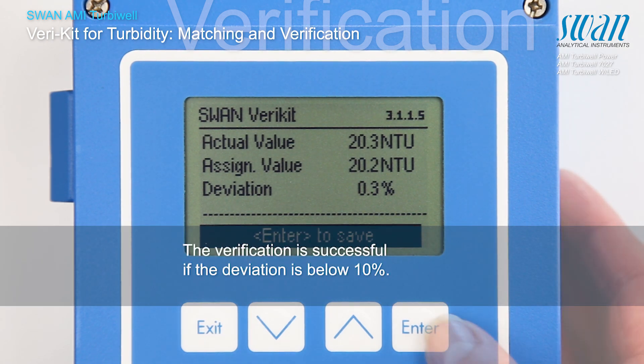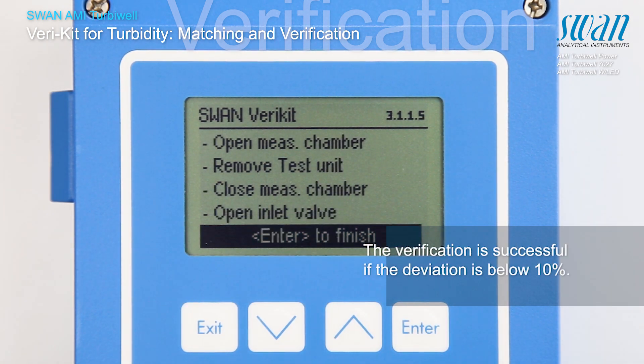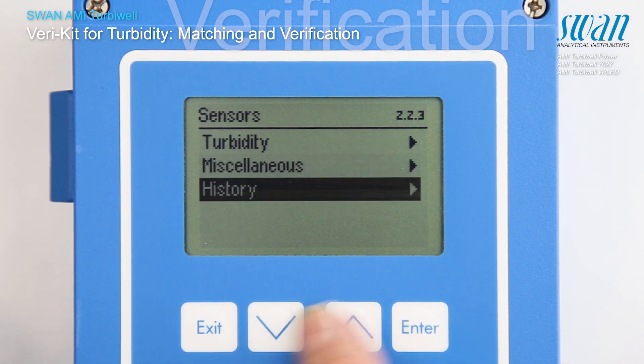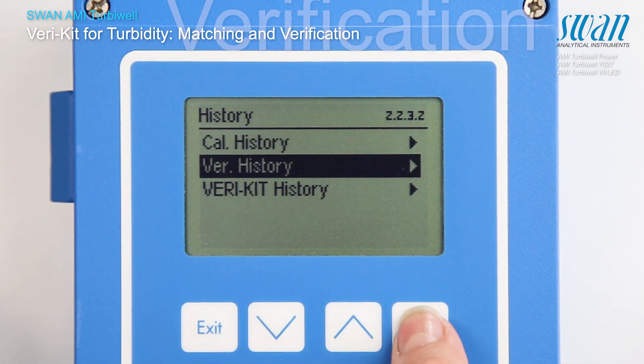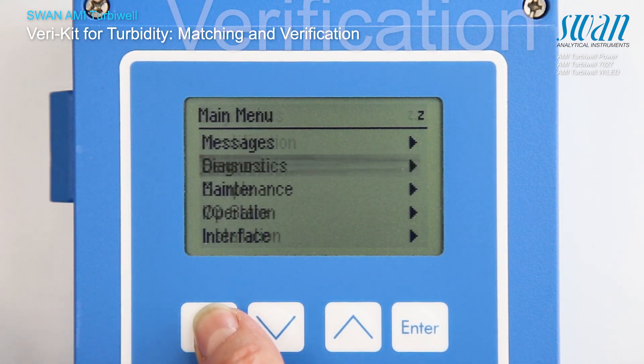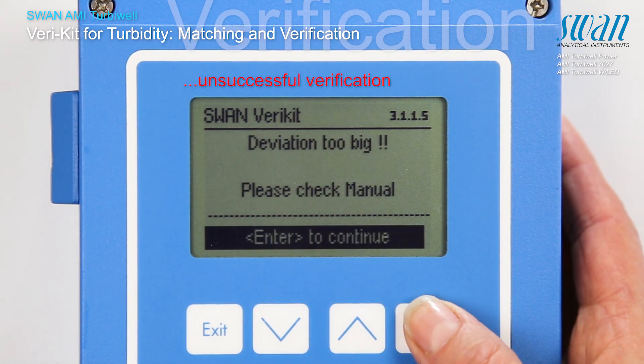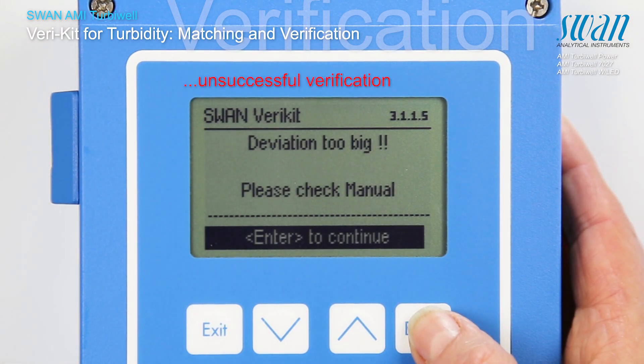The values of a successful verification are stored. In case the verification was not successful, the following error message will appear.